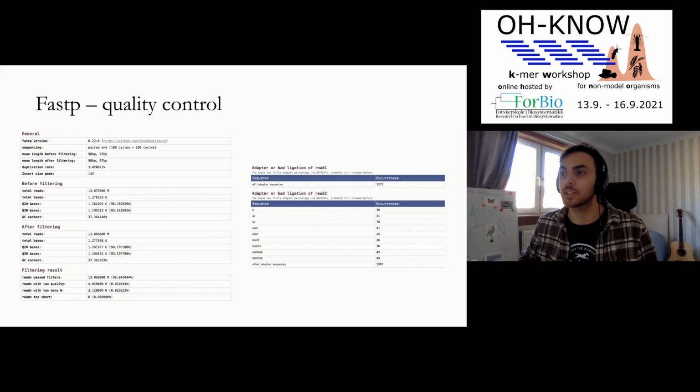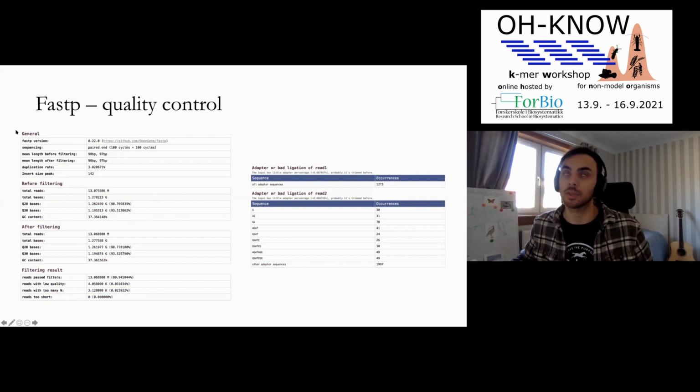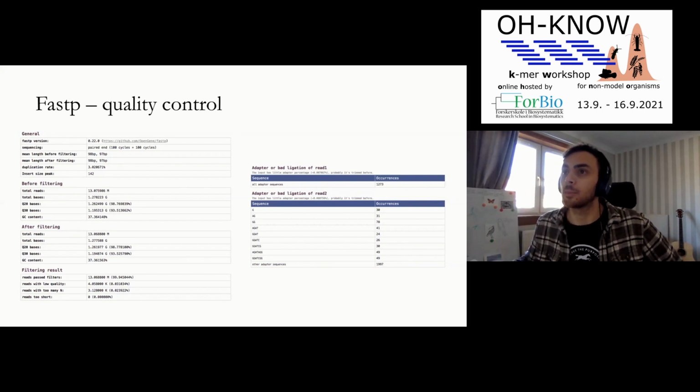Some of you might be familiar with FastQC, which I think used to be sort of the gold standard, but I actually think with new data, especially from things like NovaSeq, fastp has a lot of benefits, which I hope you'll see. And so I thought I would just talk through the expected output of fastp so that when we get there, you can maybe interpret it a little bit for yourselves.